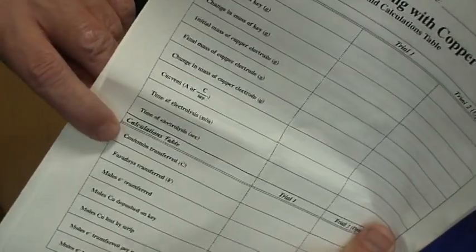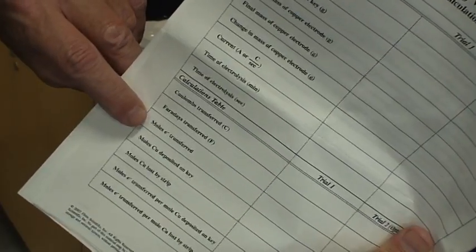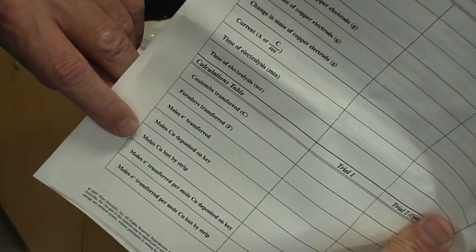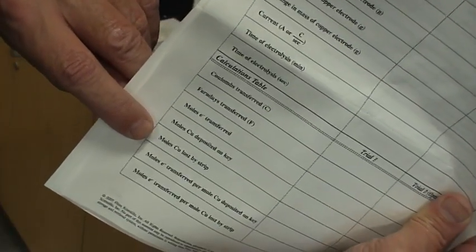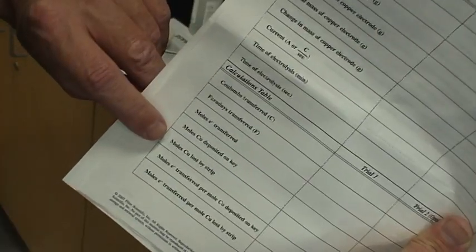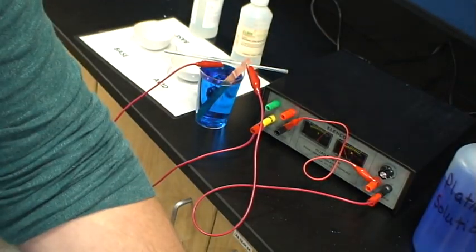Then we can take a look at how many coulombs were transferred, Faradays, the moles of electrons transferred, moles of copper that were deposited on the key, and the moles of copper that were lost by the strip. The law of conservation of mass says that these two should be equal to one another, and we can calculate the amount of deposition based off of the electrons being transferred.